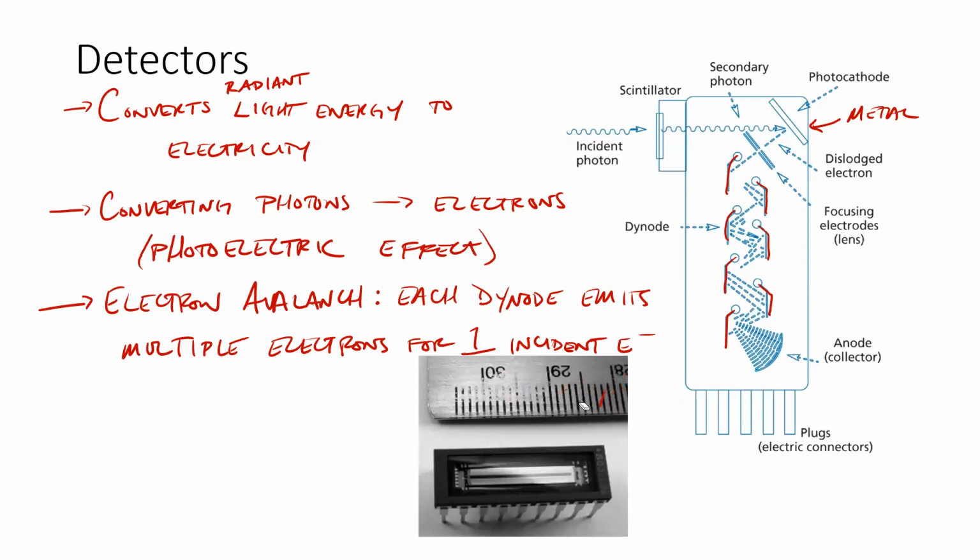Not too bad. So this is a diode array detector. Let me sort of draw a line there. There's a diode array. Okay. LED, I don't know if you remember, stands for light emitting diode. Right?